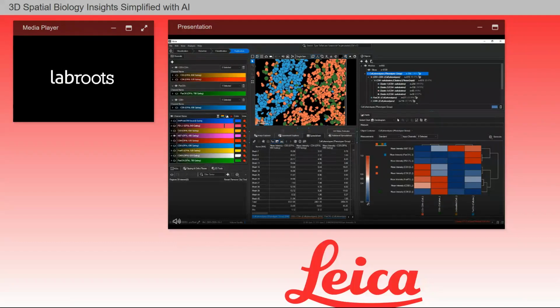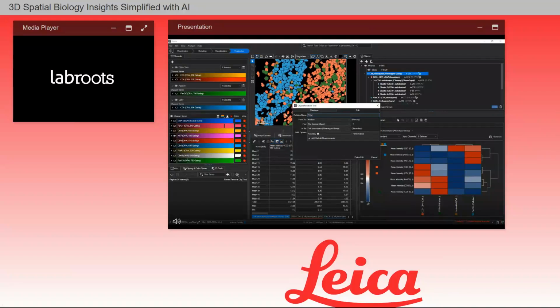I can go to the spreadsheet and open the Relations tool window. In this window, I am going to create a new relationship called T cells to epithelium. Starting from my CD3, CD4 positive subset, I want to find the nearest object to my pan-CK positive subset. Actually, from the pan-CK positive subset from the cell phenotype set. Then I'm going to click Finish Edit, then Apply Changes.